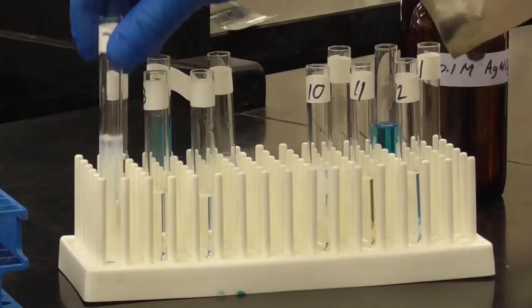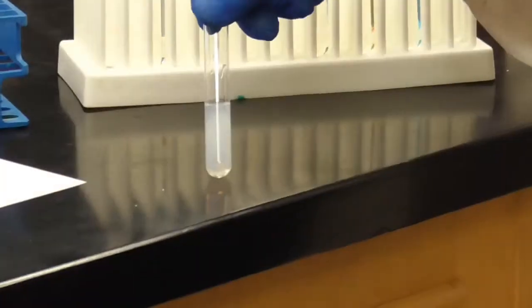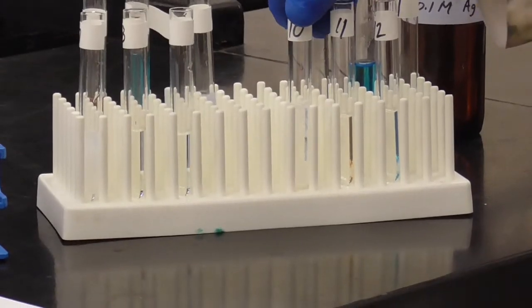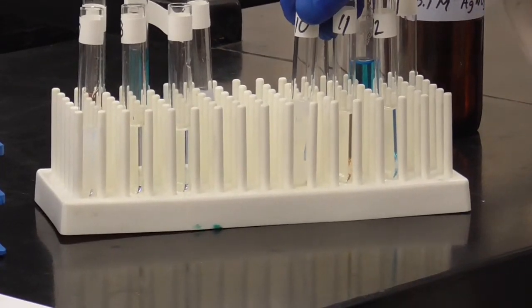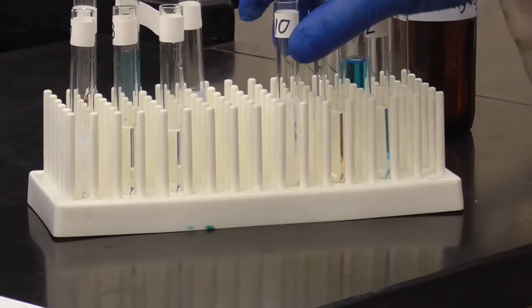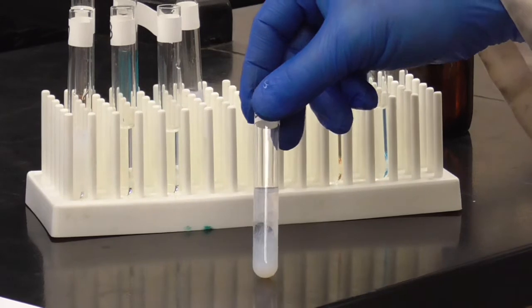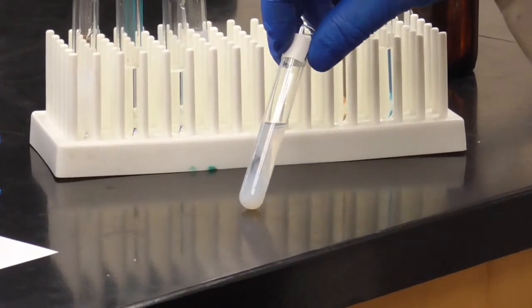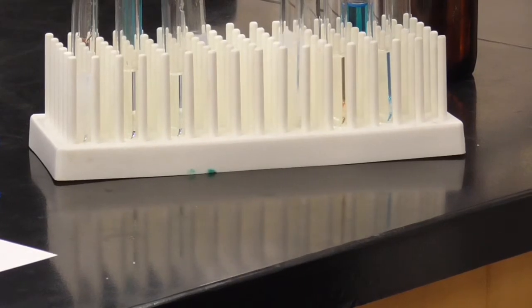Take a look at this. You can see again that milky thing, so that would be a positive test for the chloride, as it was before as well, as you remember. And in the inside of the tube, this is a good question. Did all of the chloride exit the tube, or was there some still remaining in the tube? Well, here's your chloride test from the inside. Okay. All right. Let's do the next one.